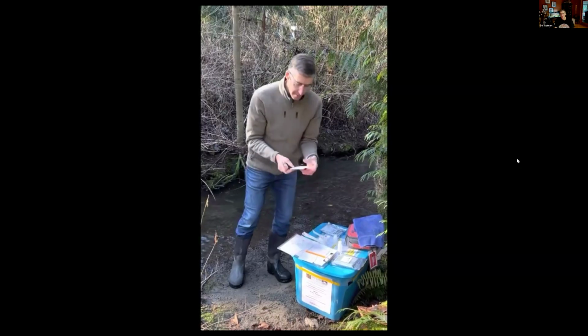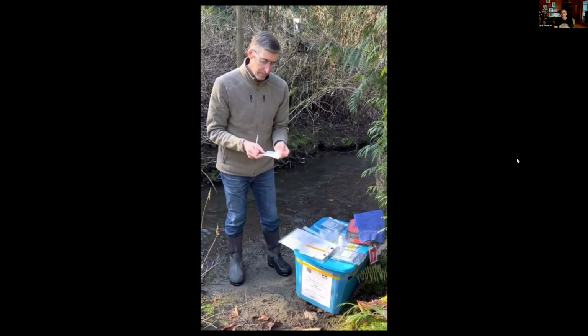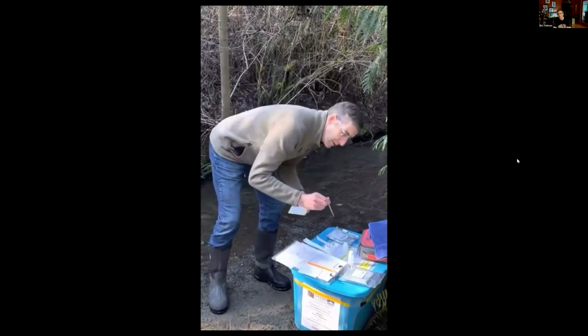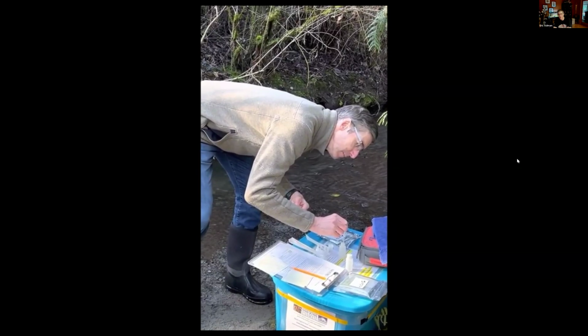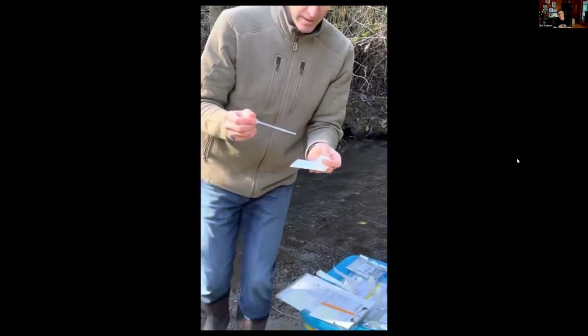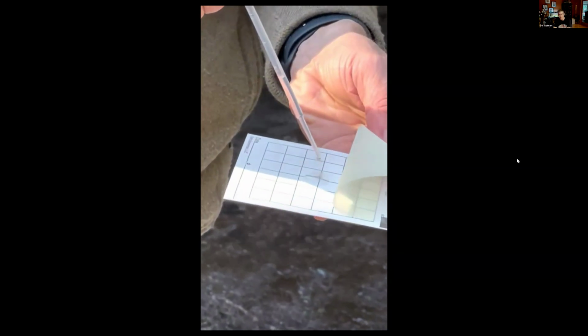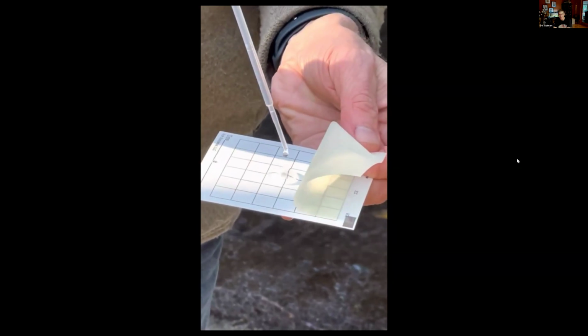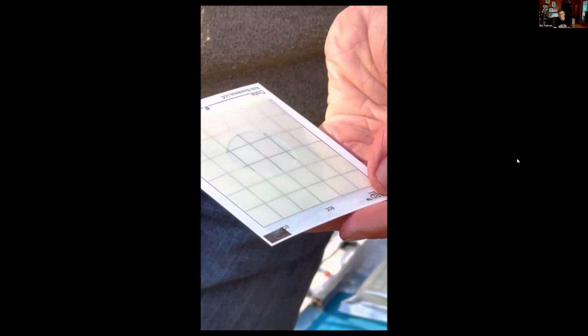I'm going to get my R card ready to collect a sample. So I'm just going to carefully pull this back. And I'm going to draw a 1 milliliter sample. And again, I'm just going to carefully place my 1 milliliter sample in the center of the card until the whole sample is there. Let the flap drop back, and then I'm just going to watch that sample and let it gradually spread out.